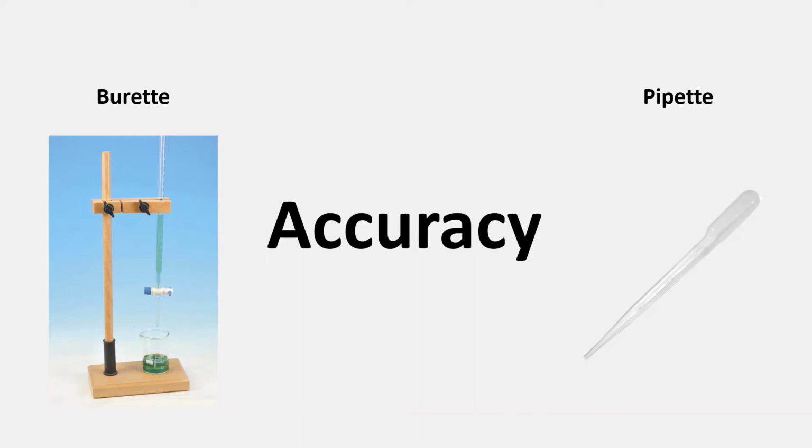However, I don't have one of these at home, and instead I'll be using a plastic pipette, which will give my experiment a very wide margin of error. But we can still see what happens, and we can still do these measurements even if they're not perfect. So let's crack on with the experiment.